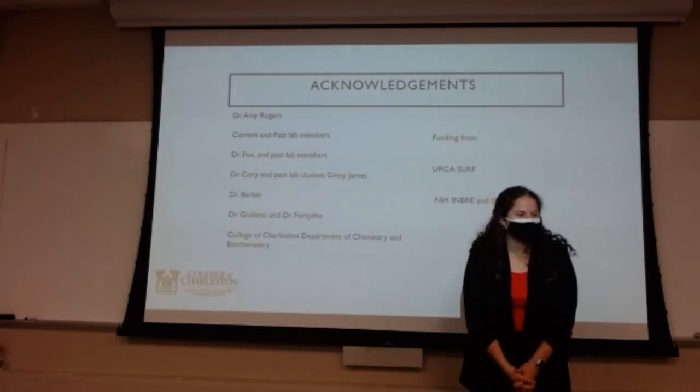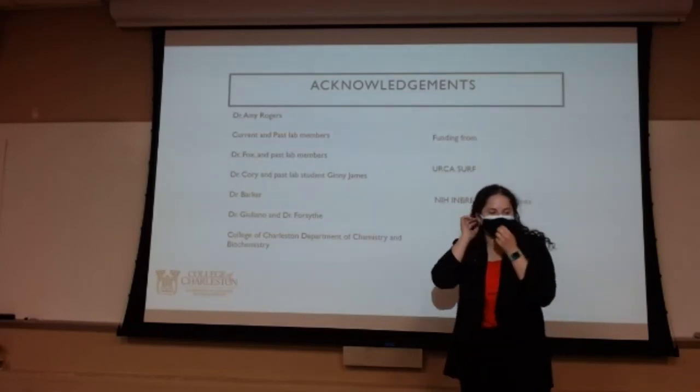I have another question. That nickel column approach to separate the compound, that's pretty cool. Is that a common approach? Oh, for the histidine tag on the end of it?